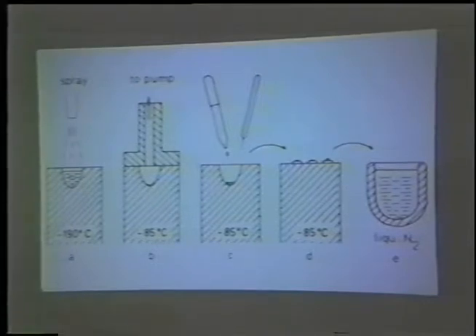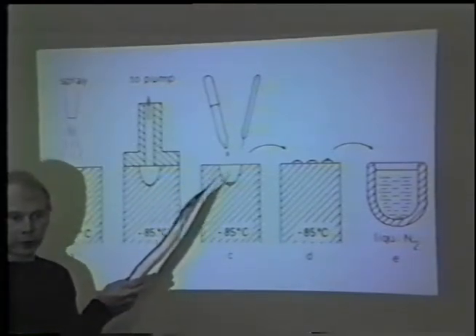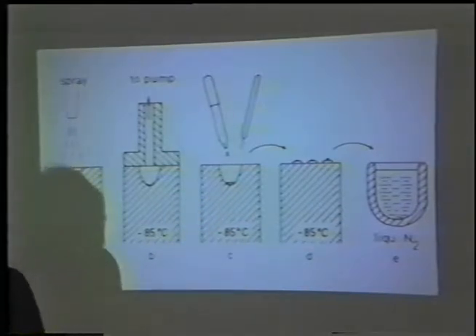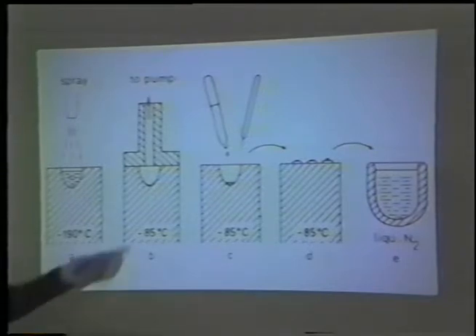Now, could you substitute from that? You could substitute from that, but I wouldn't put it in the butylbenzene if you're going to do that. There'd be no reason to do that. I would go directly from the powder. So you would go from the powder right into your substitution. Yeah, I just pour the substitution medium right in there.